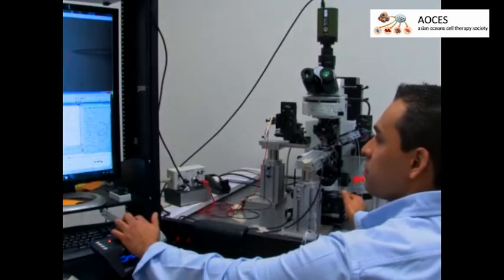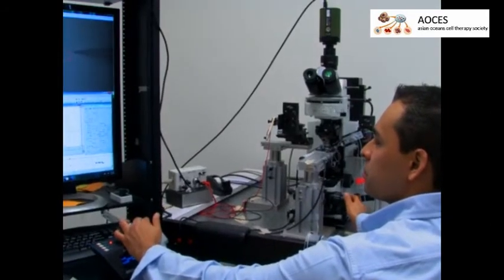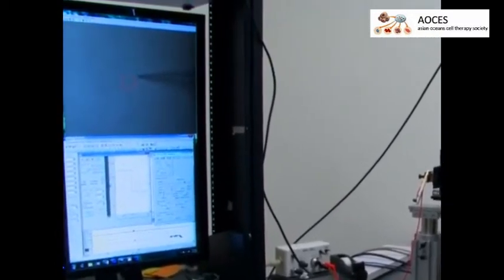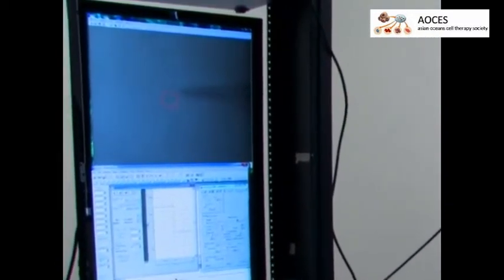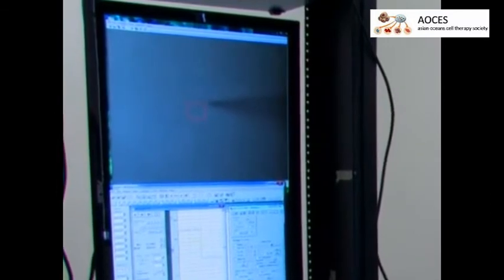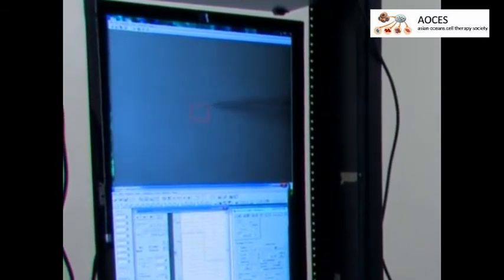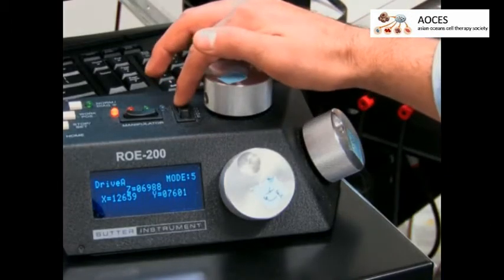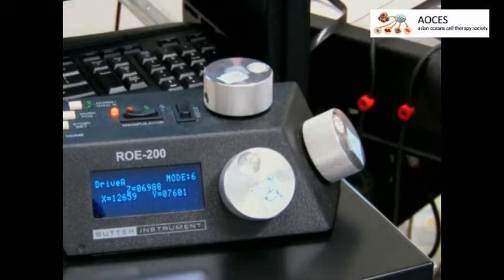Using the fine focus wheel of the microscope, start focusing down while lowering the micropipette gradually. Always focus down first and then lower the micropipette to the plane of focus to ensure that the micropipette tip does not abruptly penetrate into the slice. When the micropipette comes in contact with the surface of the slice, slow down the micromanipulator speed to medium-low mode. Gently apply light positive pressure to clear any debris on the path.